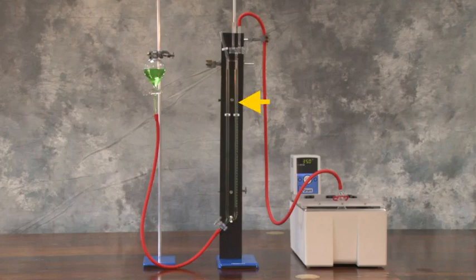In here we have some coloured liquid, and the gas will be evolved. It will push this liquid down the tube, and we can therefore see the volume which is being evolved. You need to be a little bit careful because the liquid in the left hand arm will actually rise, and therefore there'll be a pressure applied to this volume of gas, and that will give you an incorrect reading of the gas volume.